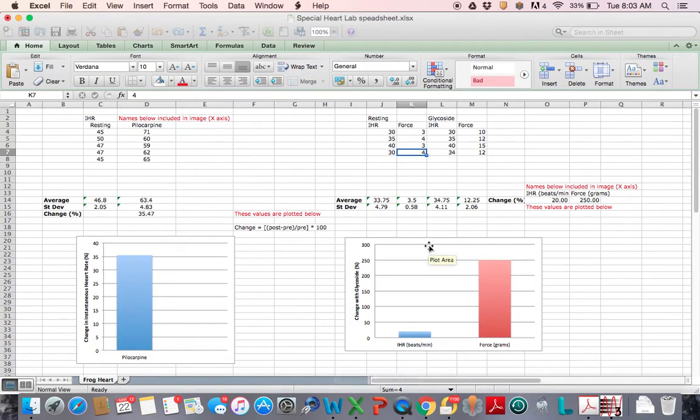So 0.379 might fit in here, 0.379. And then you can measure, maybe you get 0.4, 0.376, 0.39 again, or something like that. So that would be your numbers there. And then you can calculate what it is after the glycoside too. Wouldn't that be great if it was actually higher? I don't think it actually is, but you can determine that. And whatever those numbers are, as you measure that V2 minus V1, you can determine it.